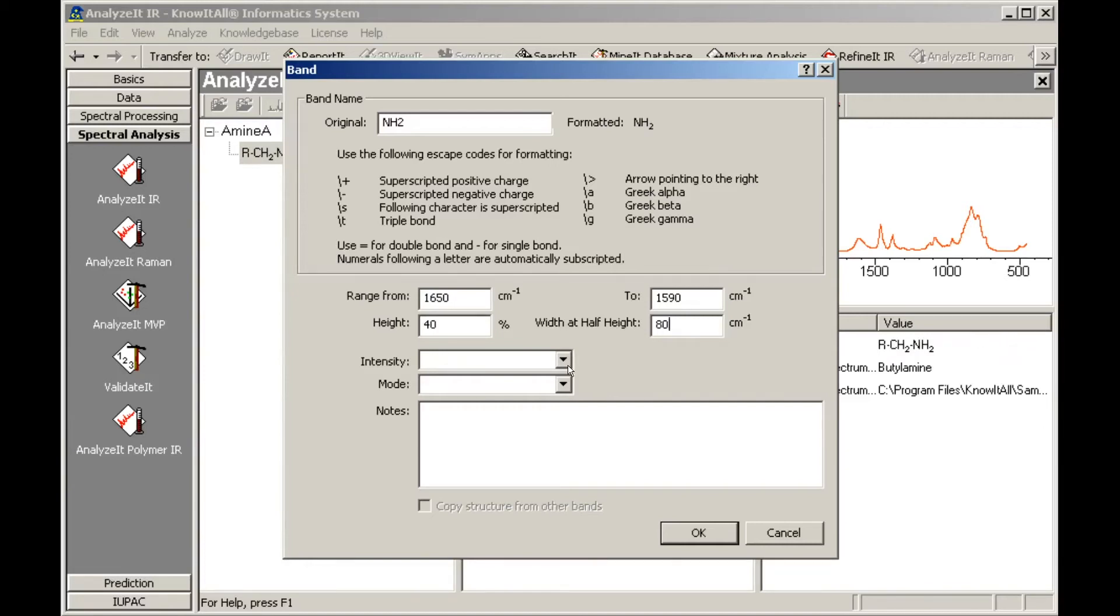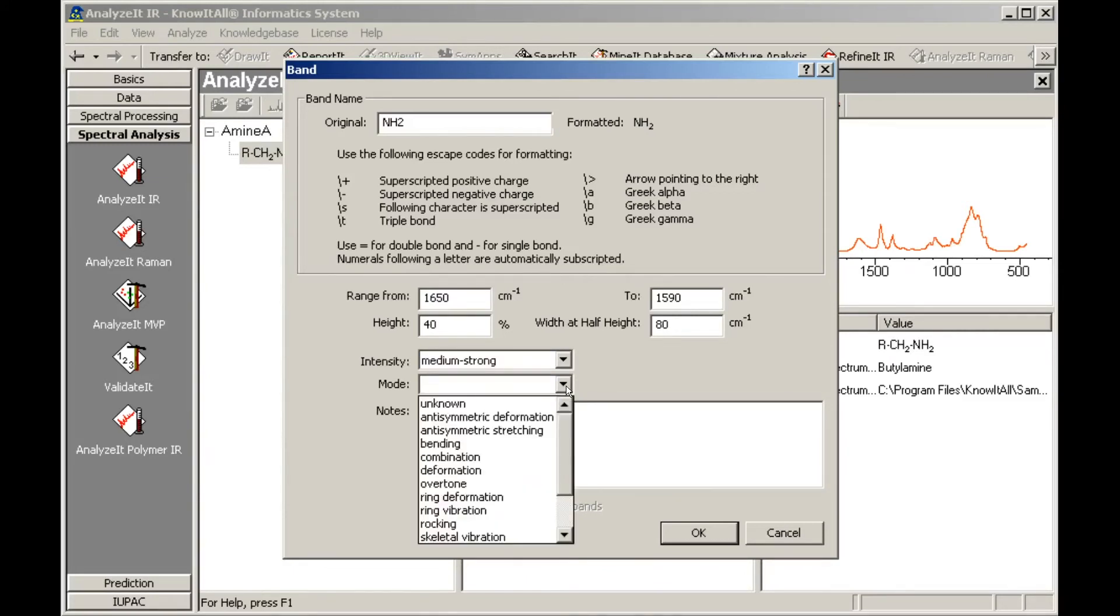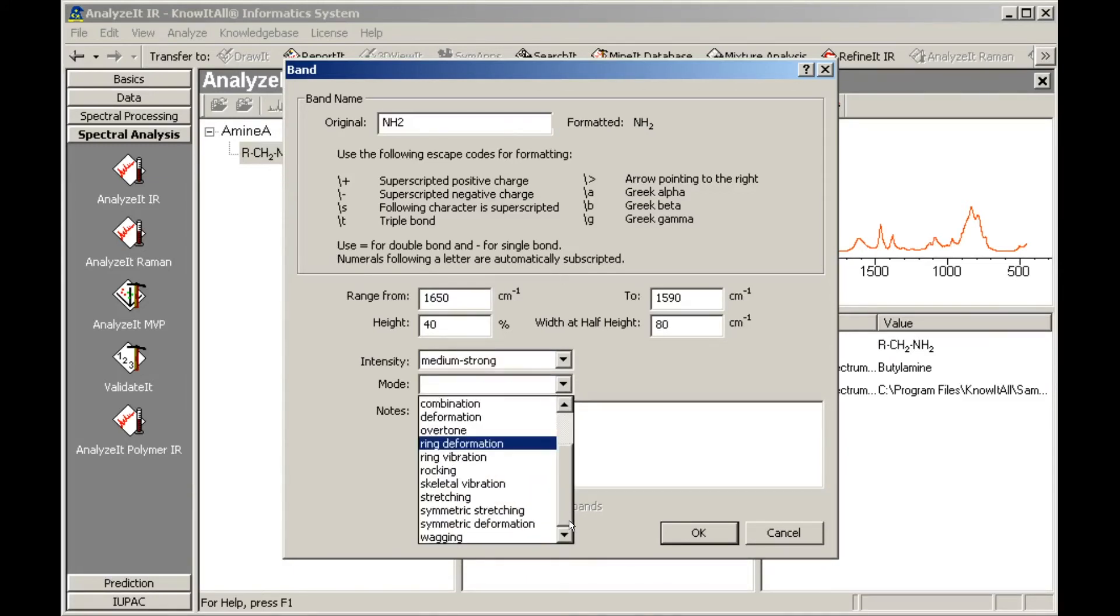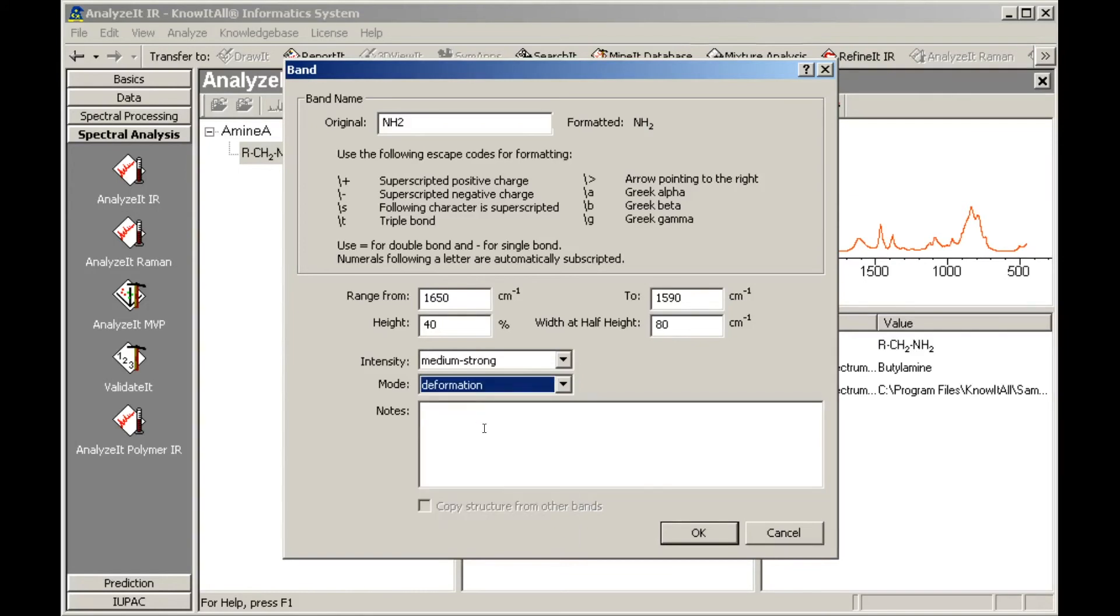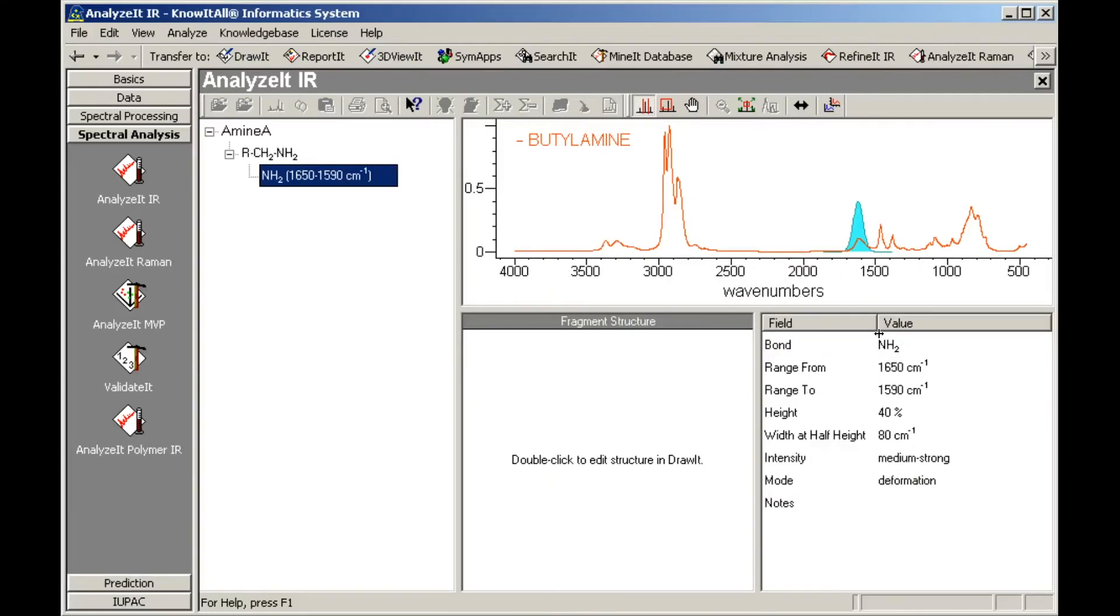Make sure to review all the intensity and mode possibilities for the band before assigning these values. Click OK to accept the default parameters for the new user knowledge base. We will use the Draw It application to add the fragment structure. Double-click in the fragment structure pane.